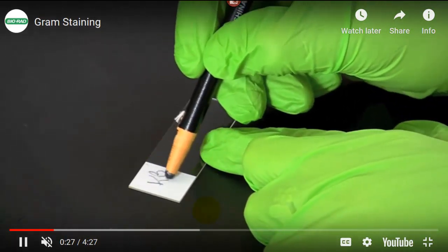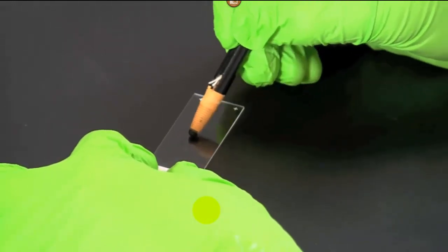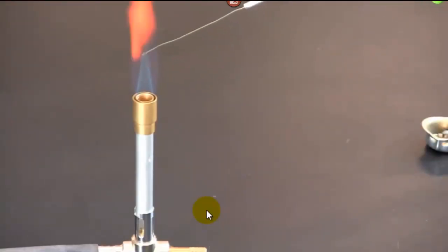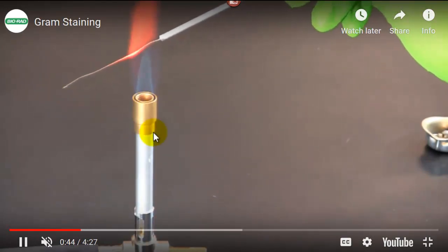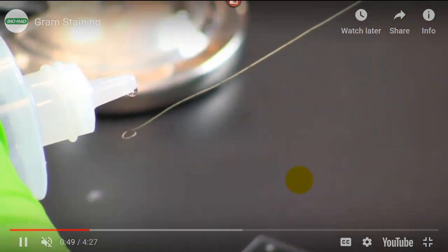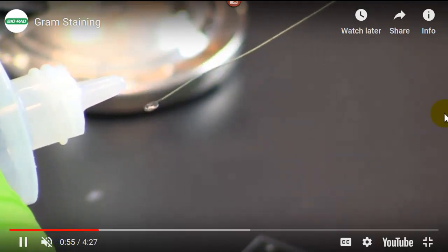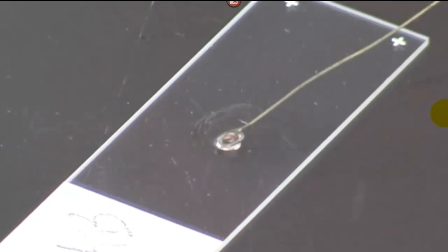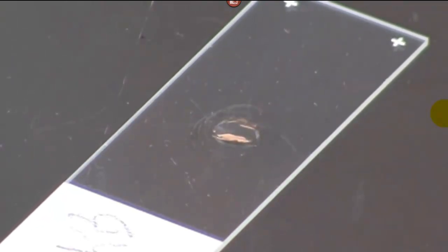And I was doing a little commentary on the simple stain. The part that was left off was you let the water and bacteria air dry, and then you heat fix it, and then you stain it. So this person drew their circle. It looks like this is a loop, and they're now sterilizing their loop, aseptic technique. Now that's interesting. We do it this way. We can put a drop on the slide. That's a good way to do it. That way you're not getting very much water. If you put too much water in this process, it takes forever because you have to let the whole slide air dry.